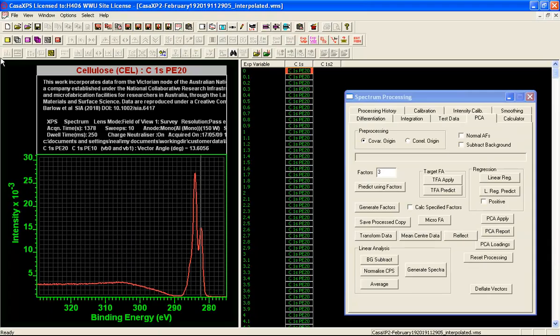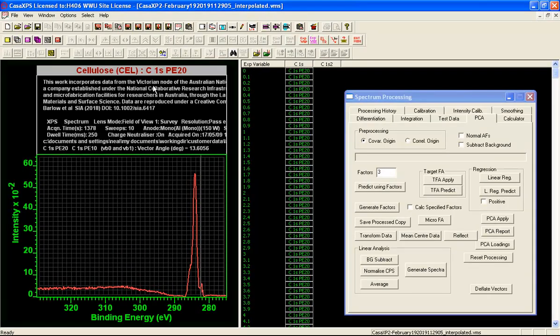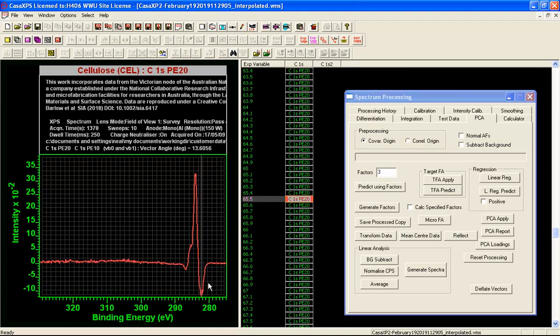So I've got a new VAMAS block, which if I display I can then step across with the arrow button, and then that leaves me with a position within the list that corresponds to something that I feel more comfortable is relating to the cellulose. And so if we carry on going, we should find that we see different spectra. That this is a characteristic difference spectra where you've got a negative going peak that is non-physical.